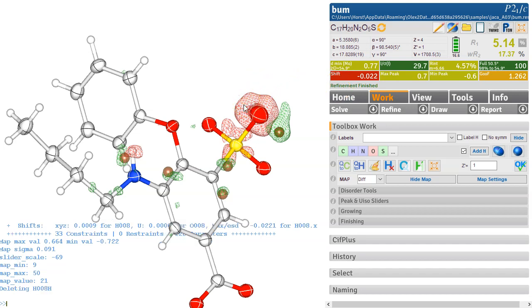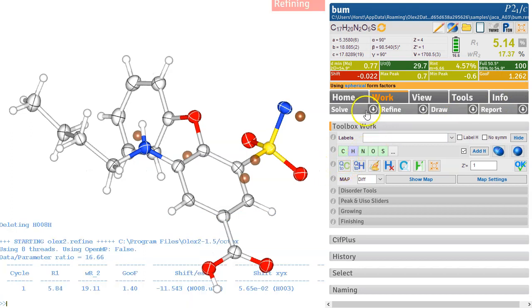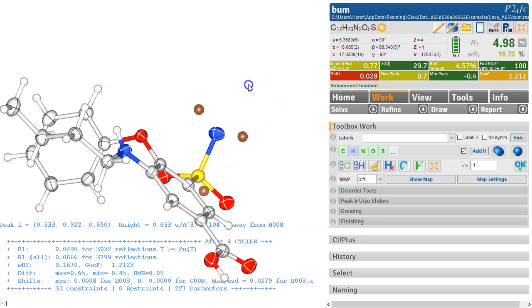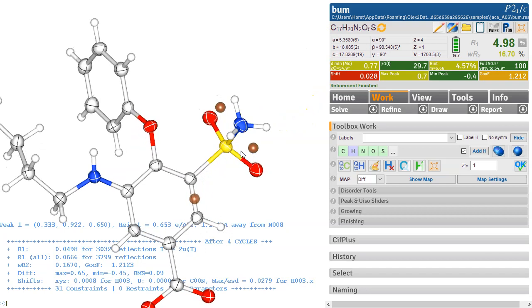Let's delete that hydrogen again, Control M to get rid of that map and make this a nitrogen, the next lighter thing. And let's refine that. And that looks much better in terms of the size of the ADP. And of course, the R factor looks better and we can see it's an NH2. So H add will add that. It adds three hydrogens.